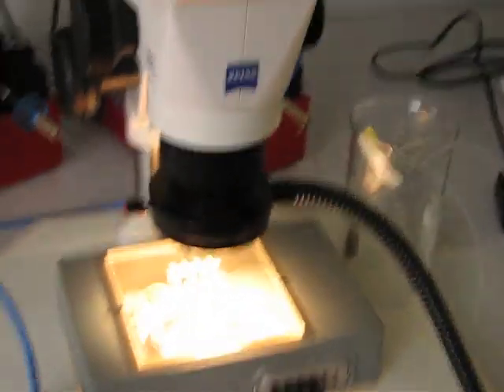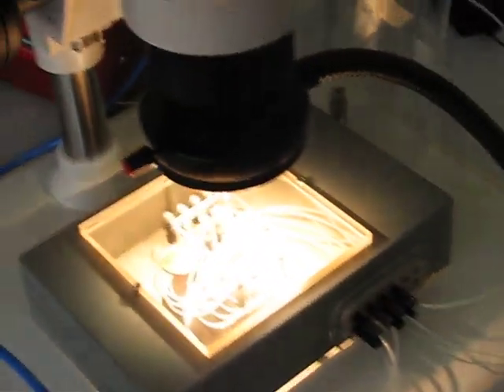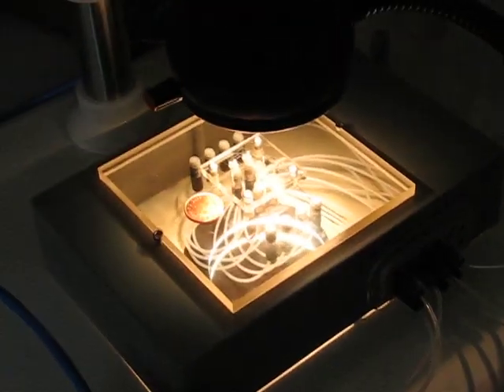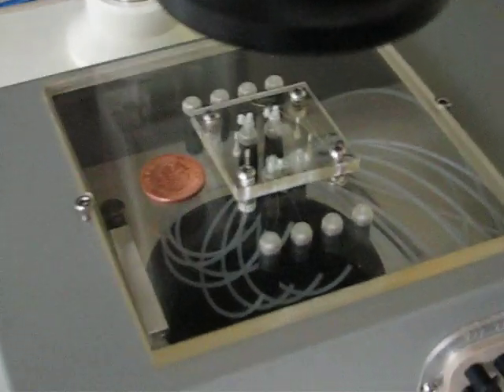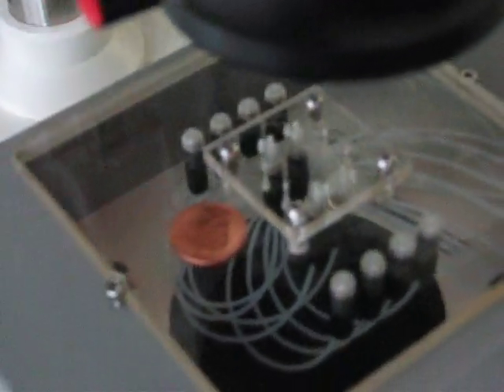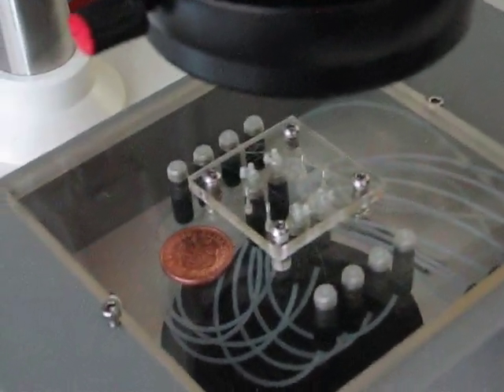And can I have a look at the chip itself? Yeah. And if you could turn off the light because I won't be able to. Now, this is much better. So, this is the actual chip. This is the platform where you're using. And you can compare the size with this coin here. Yeah. And this is a one penny coin.